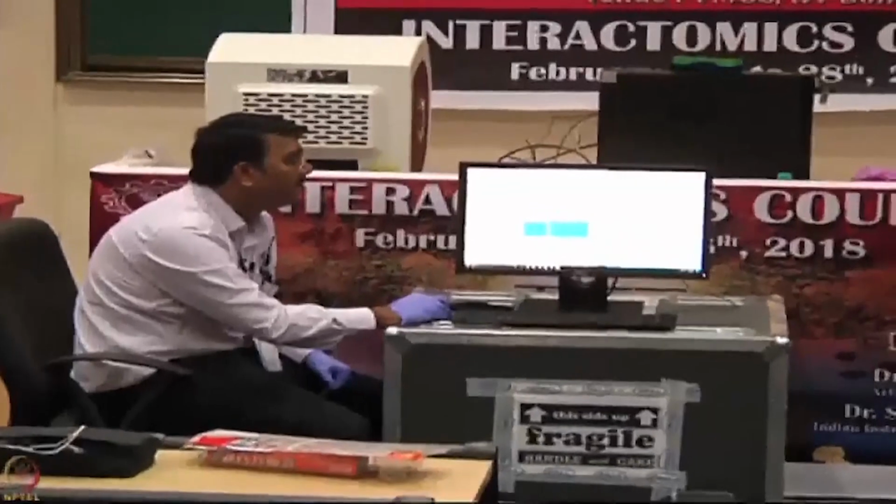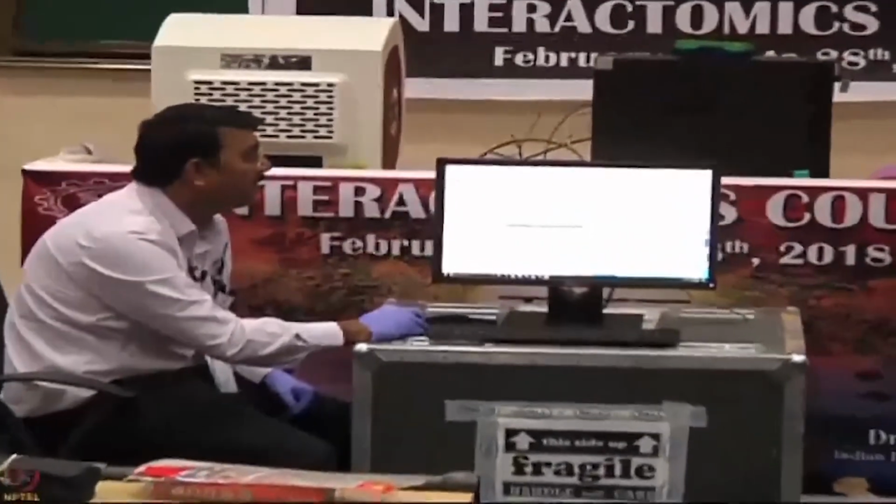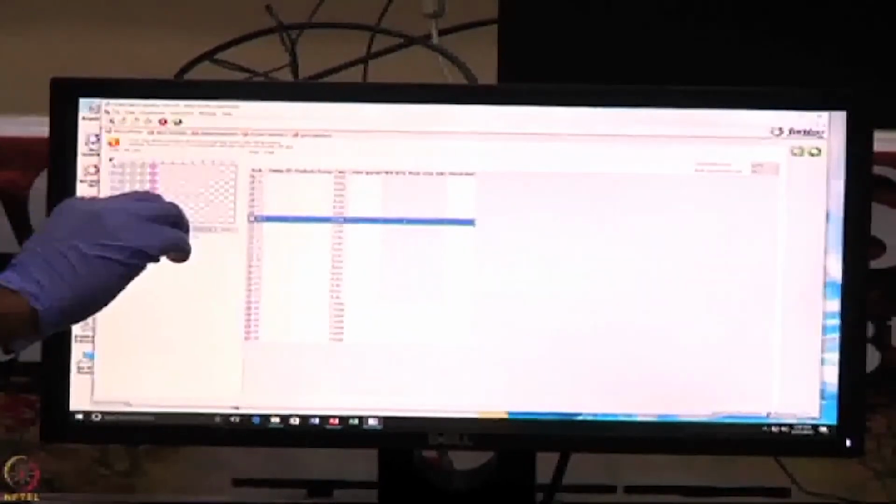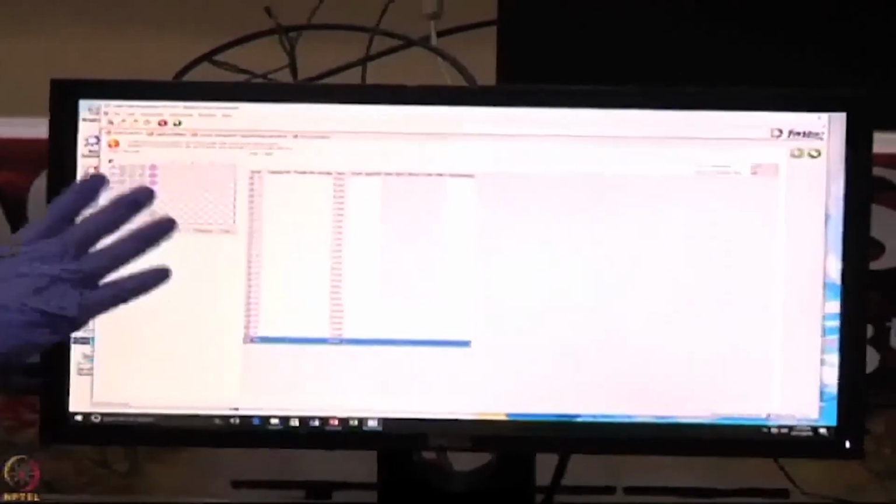So how are we doing this? The fourth is your sample, so assign it as sample. But I am using only 7 sensors, not all 8 sensors. What I will do is select it and remove it. So just the sample with 6 concentrations and 1 next to it as the blank. Or if you want, you can assign this last column as a blank buffer like this. So these are the plate definitions.